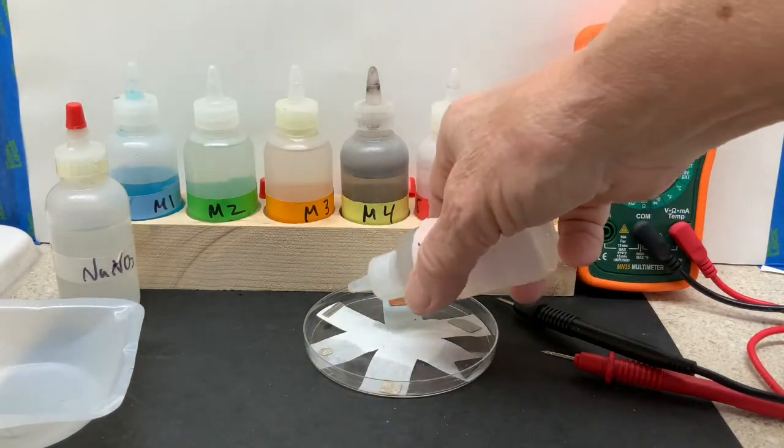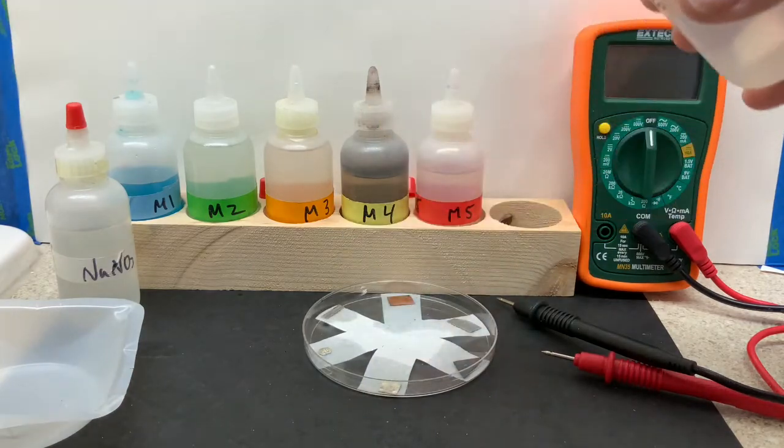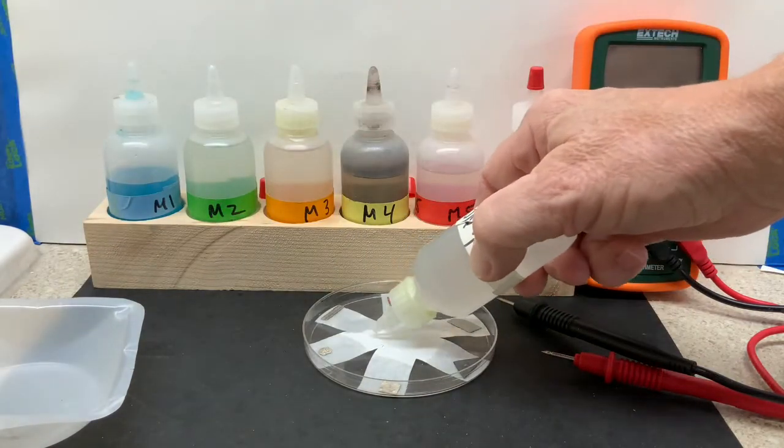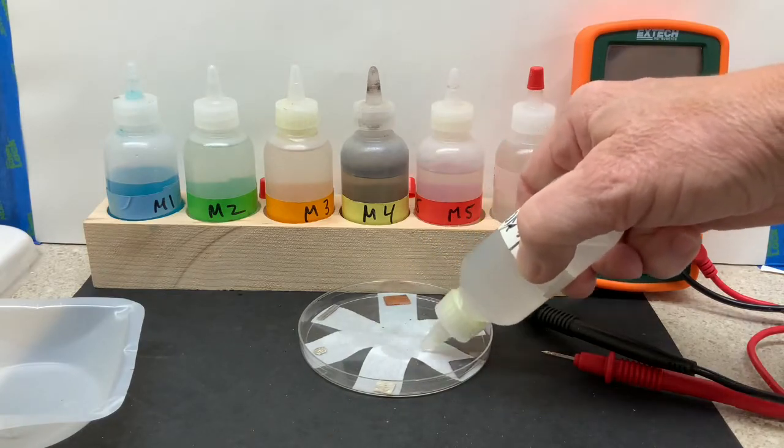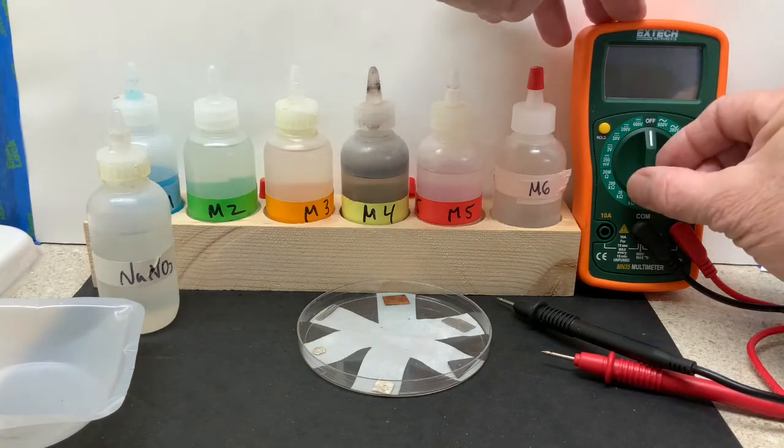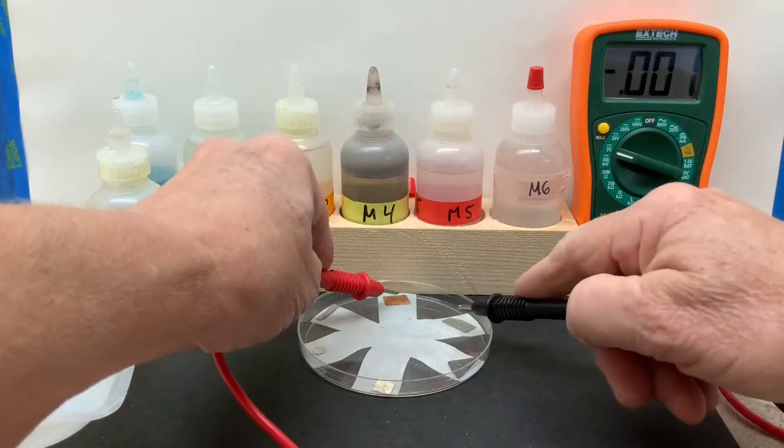Notice that one drop is used; it will bleed towards the center. We don't want it to go all the way to the center. Then the salt bridge sodium nitrate will be filled in to connect all of the six half-cells. The voltmeter is turned on to two volts.